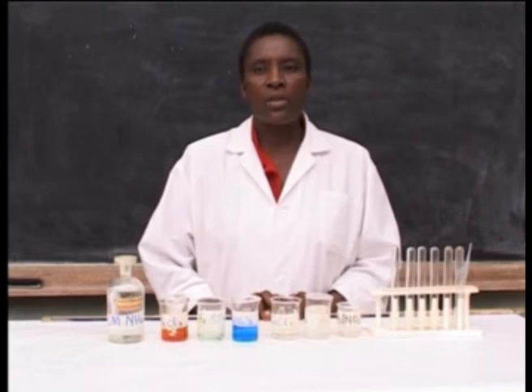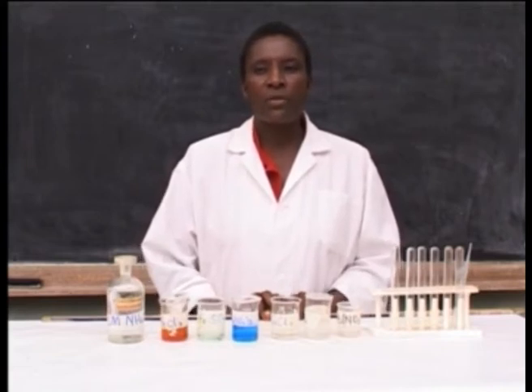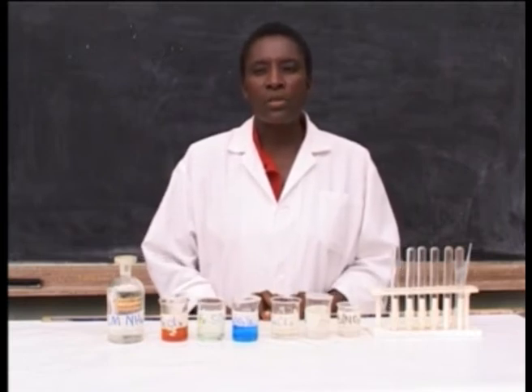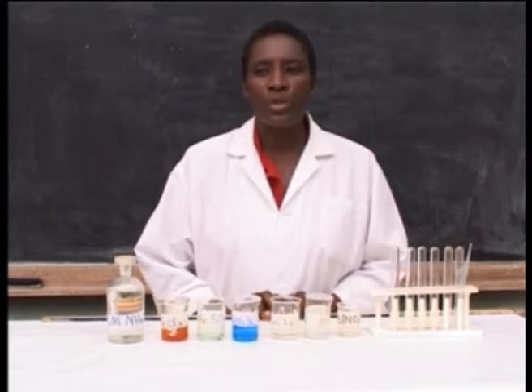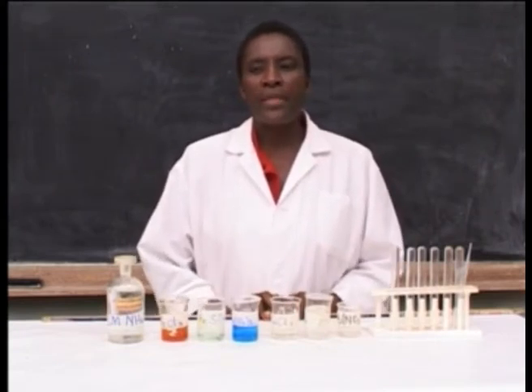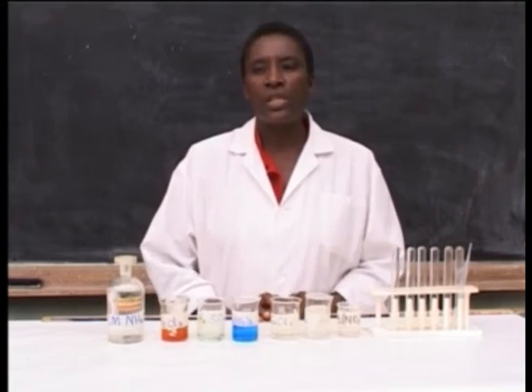There are salts which form insoluble precipitate in excess of ammonium hydroxide solution, and those which dissolve in excess of ammonium solution. Aim: to examine the products of reaction between salt solution and ammonia solution.